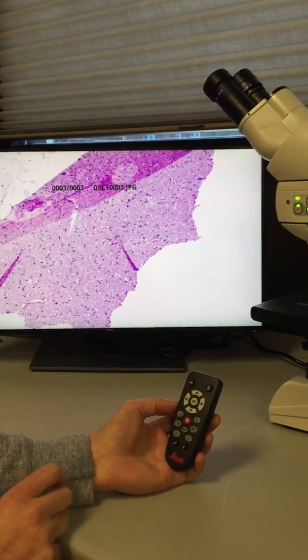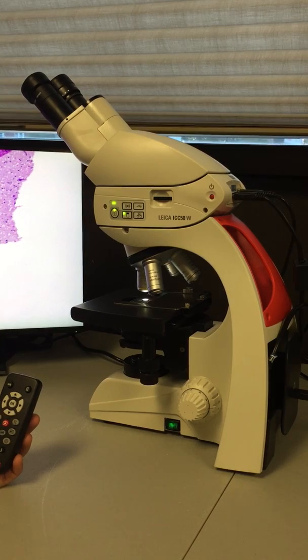Those are the features and functions of the Leica ICC50W camera output HDMI mode.